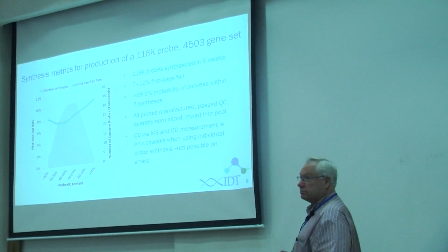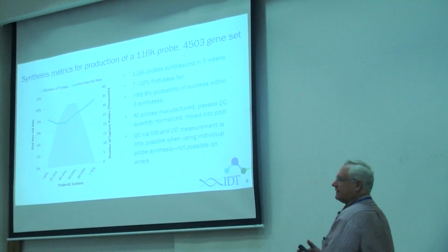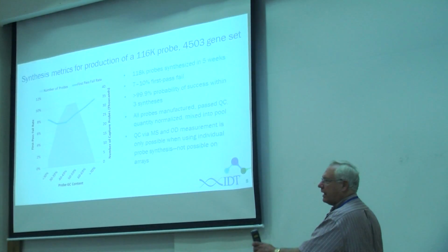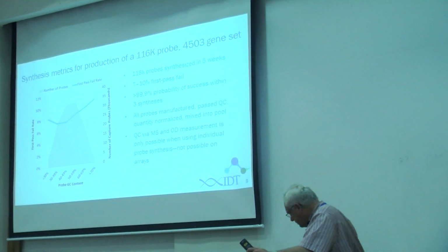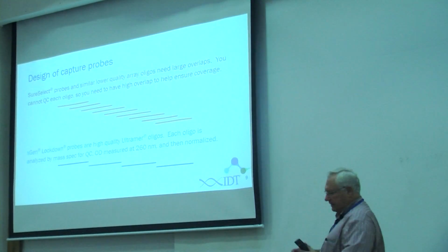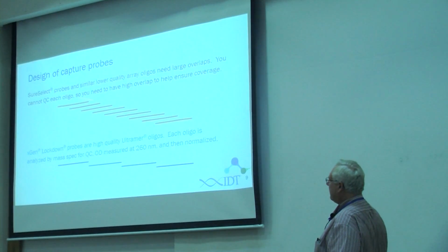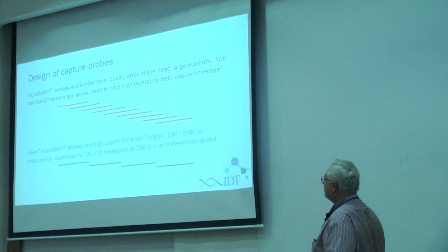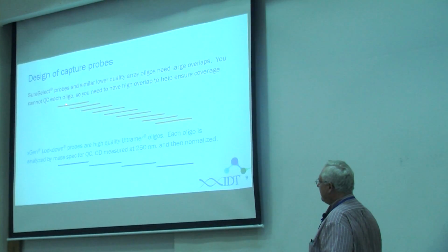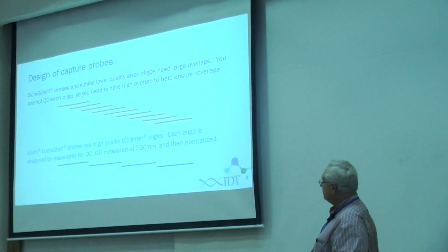And we remake them, and then they're good. And so these things will fail at that same frequency on an array, and you'll never know it and can't do anything about it. To compensate for that, the way that you work with arrays is you heavily tile. And so you do many little step overlaps and try to over-synthesize, hoping that if this one fails, at least this one works. But you don't know that.